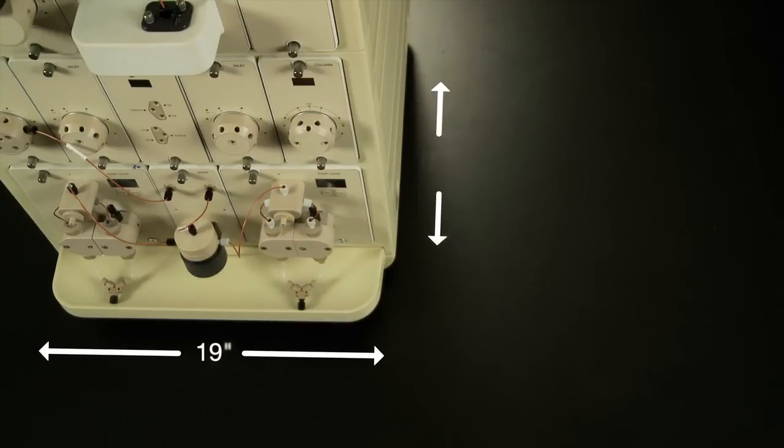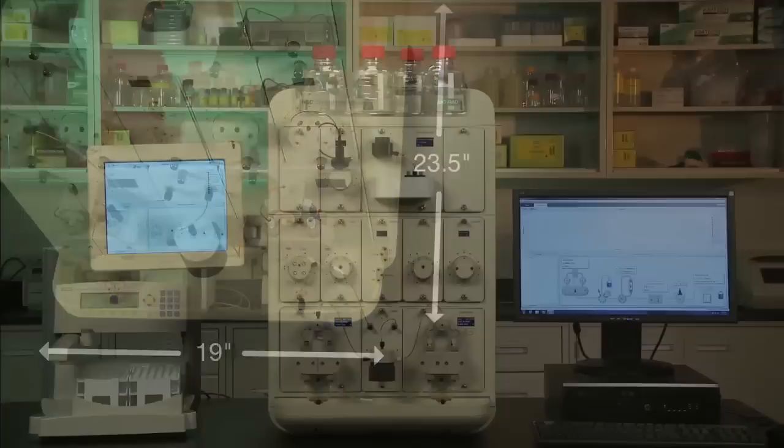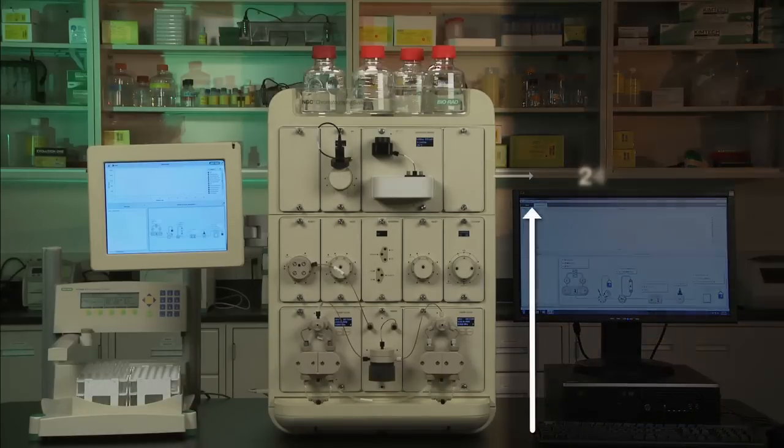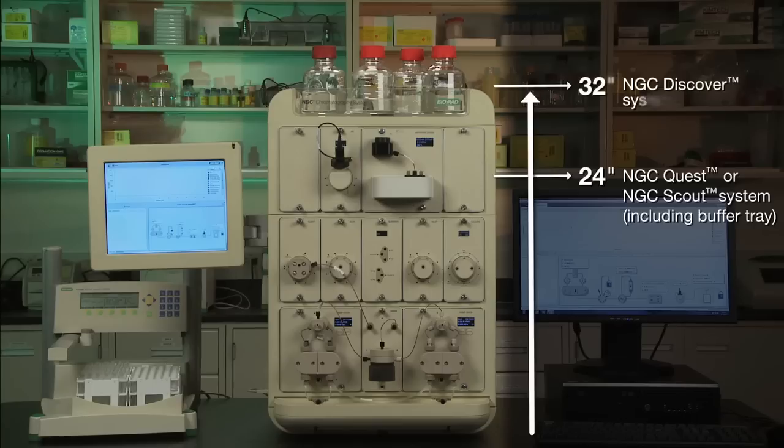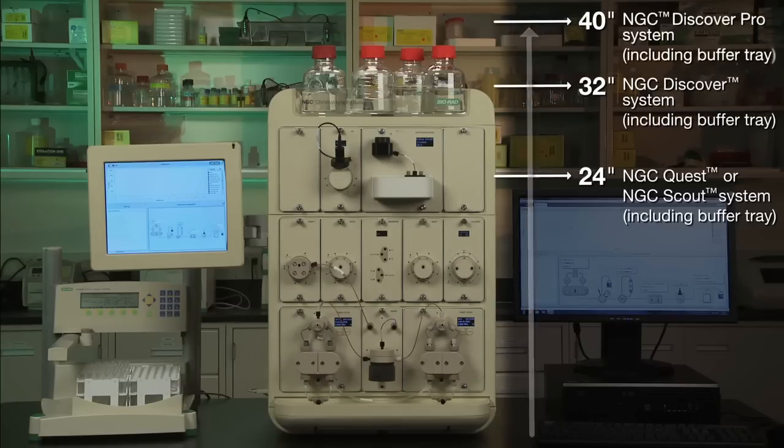A minimum footprint of 19 by 23.5 inches is required to accommodate the NGC instrument with a minimum height of 24 inches for an NGC Quest and Scout, 32 inches for an NGC Discover, and 40 inches for an NGC Discover Pro.